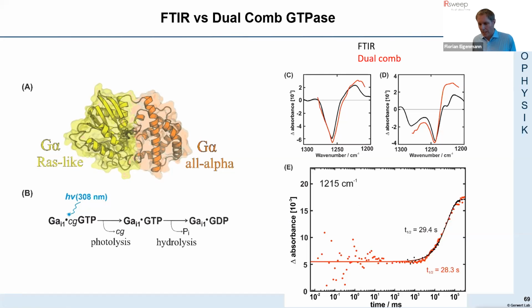Thanks. Then there's another question from Luca Quaroni. Do you have the option of focusing the beam? Probably that's a question for me. Yes, we can focus the beam. As you have seen, there are several accessories available.